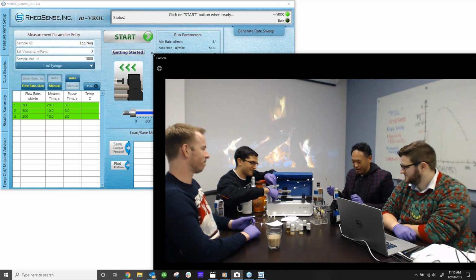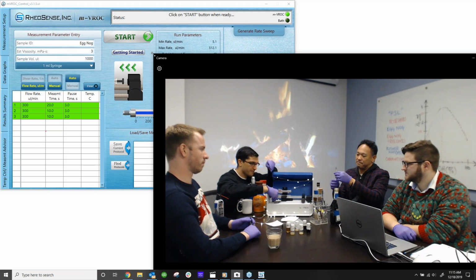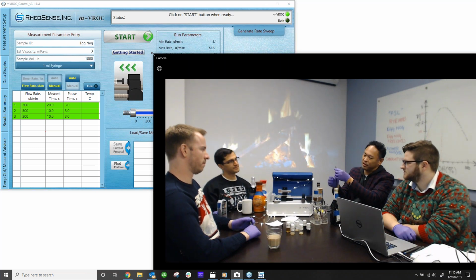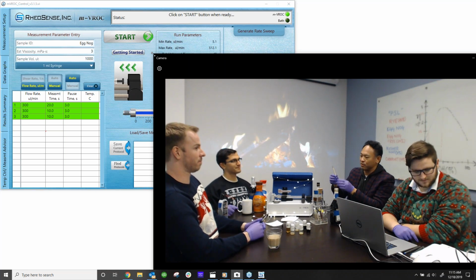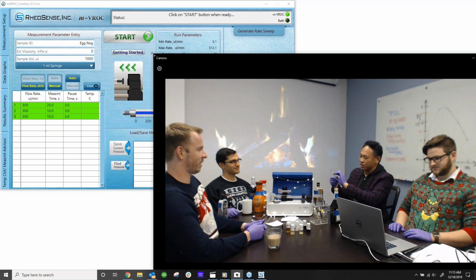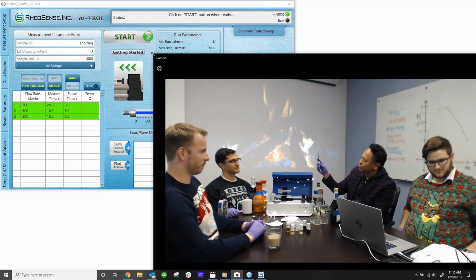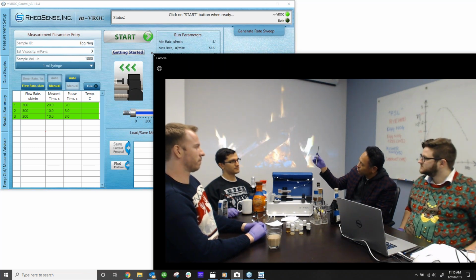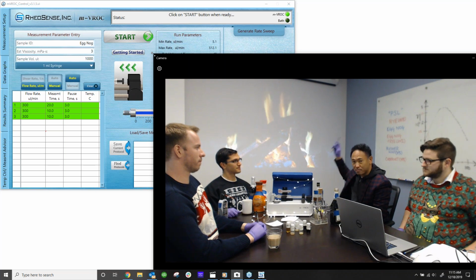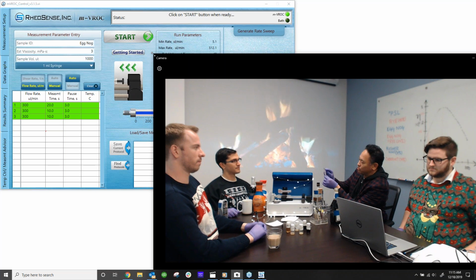And sometimes with higher viscosity samples, if you have a bubble, and it doesn't move up into the opening of the syringe, there's a special technique that you could do to remove the air bubble. How you do that with higher viscosity samples is you hold the plunger with your index finger, and then with your middle finger and thumb hold the barrel of the syringe and flick it in this manner. And so that will force the air bubble to the opening of the syringe, and then at that point you could just push it out.